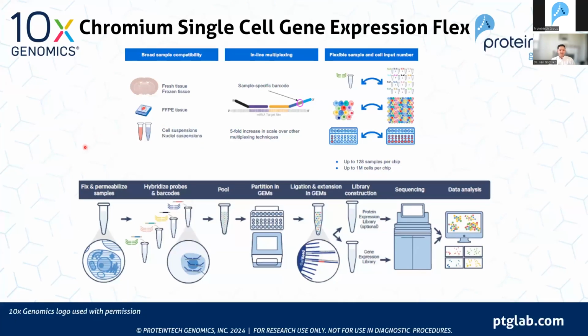So the probe-based assay is as follows. You start with your fresh cells, you count them, you assess viability, and then you go through fixation and permeabilization. This is followed up by hybridization of probes to your samples. And here we're showing that they're processing 4 different samples, and each sample has its own inline barcode, as mentioned up here. After this probe hybridization, the samples are pooled together.